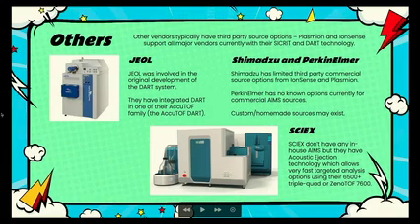Again, Shimadzu, not quite as familiar with Shimadzu's offerings, but there's nothing that I can see in their catalogue that would match the stuff like Waters and Bruker. But companies like SICRIT, companies like Plasmion offer the SICRIT source, and there was a DART source for the Shimadzu. Not aware of anything at all from PerkinElmer, but as I say, custom and homemade sources may exist for those.